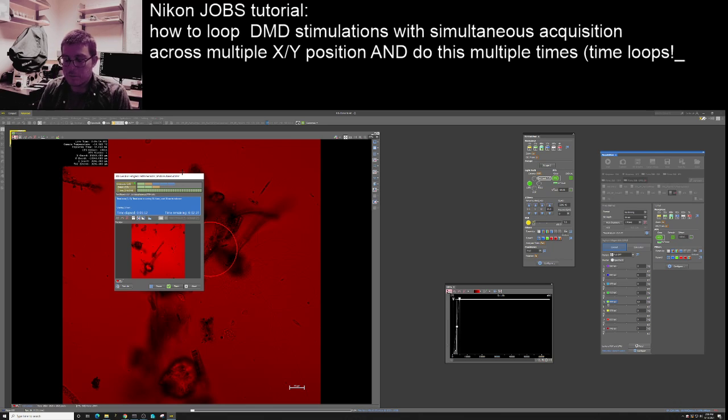All right, and I'm not going to do all 5, but I'll let it do just one more. Just trying to think if there's anything I can explain about how to set this up while we wait. Mostly it's just another matter of getting all your optical configurations set up and then making sure that when you use the jobs manager, you've nested those things in the correct order. It's easy to, for example, accidentally get your loops out of whack here.